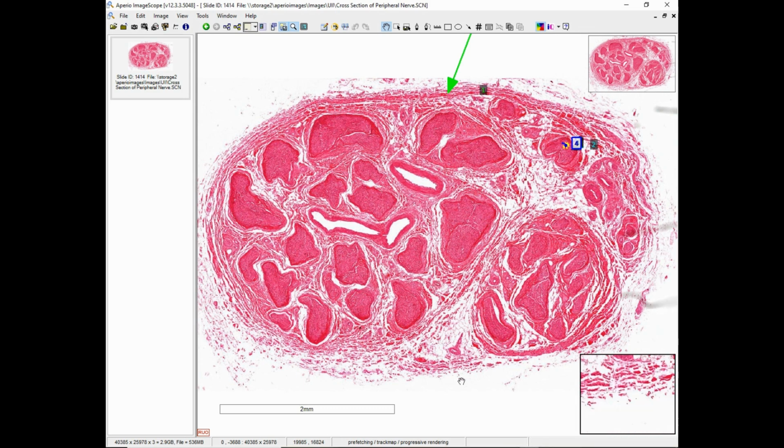And so here, what we can see is that the nerve has a large sheet of connective tissue covering it. This is called the epineurium. Epi for above or outside. So epineurium is the connective tissue collagen that's surrounding it. And each nerve, the peripheral nerve here, is made of irregularly shaped fascicles. These are collections of axons and their support cells.